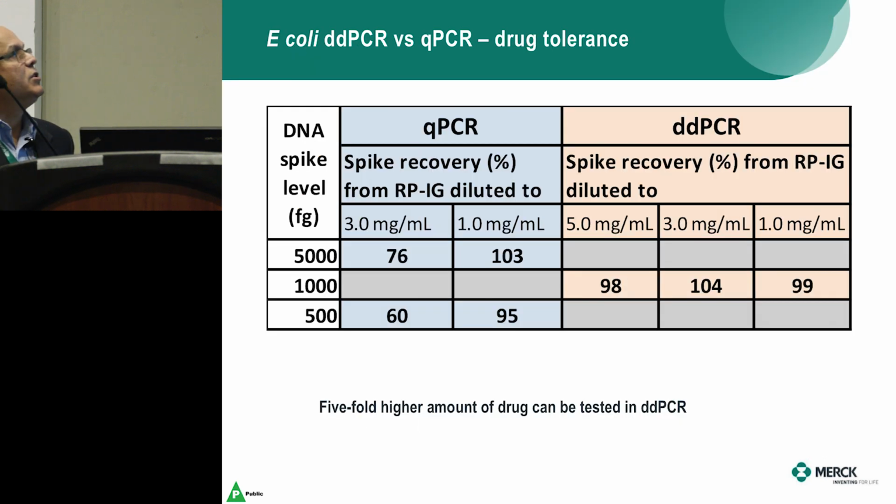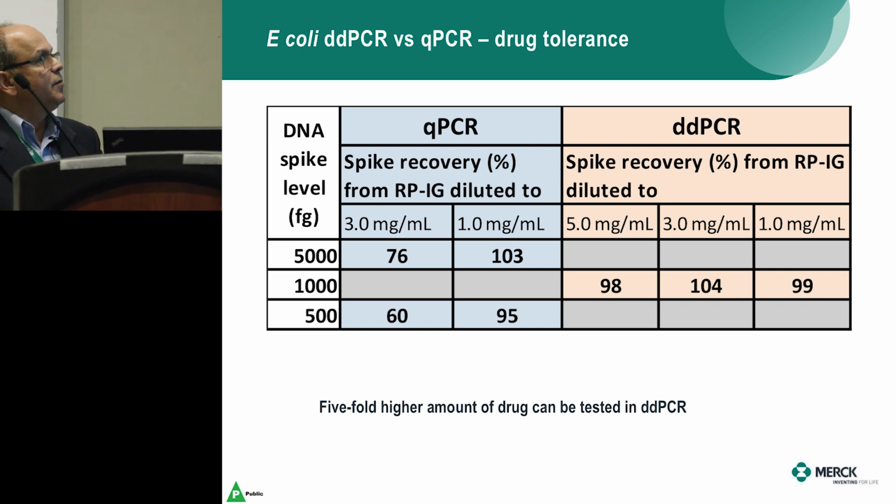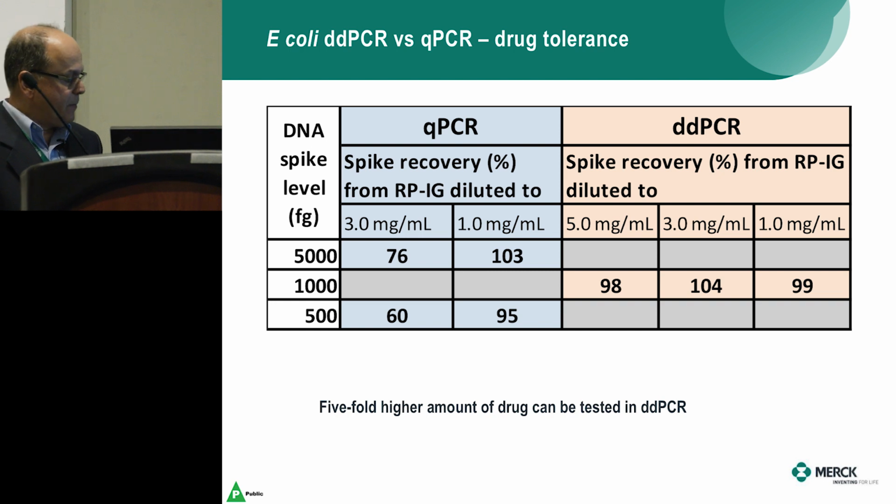This slide shows E. coli, a comparison of digital PCR and qPCR. Here, this part is qPCR. We spiked these 3 levels of DNA with the drug.